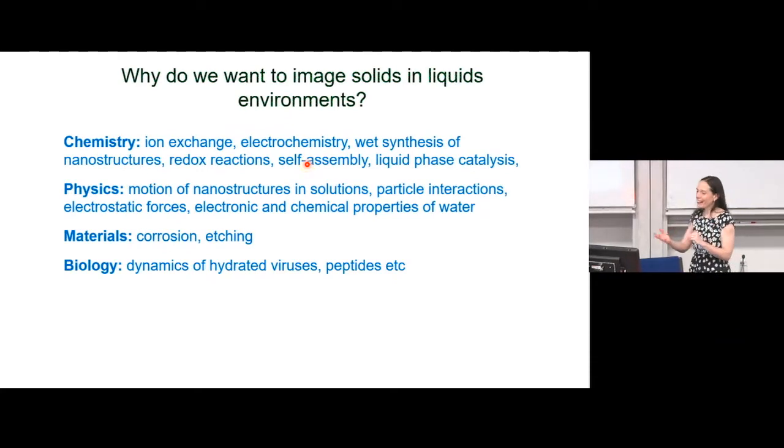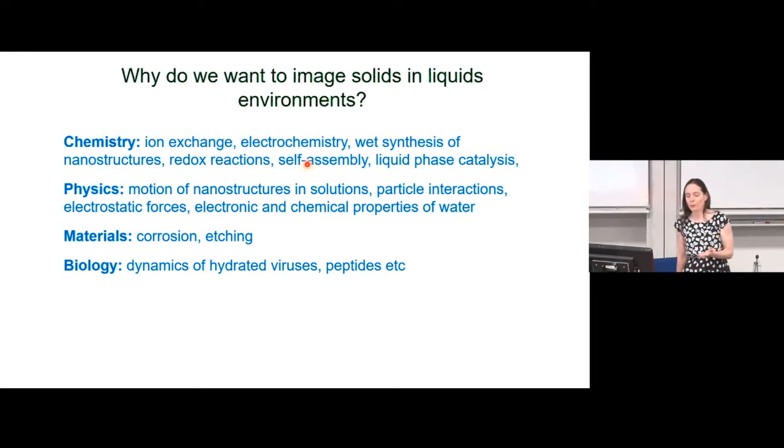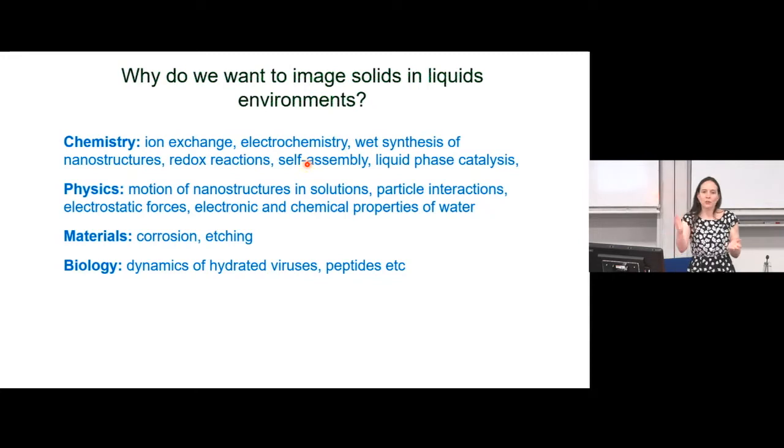So I am not studying horses or plums. There are loads of different possible chemical reactions that you might want to study that happen in a liquid environment, and these are just some of them. I've mentioned some work that we've done on ion exchange, which we've been really interested in. There's lots of work on electrochemistry, which we think is fascinating. Wet synthesis of nanostructures: an awful lot of the nanomaterials that we use are synthesized in liquids. There's physics. There are an awful lot of physics colleagues that I'm working with who are interested in understanding just the fundamentals of what happens to water at an interface. That is surprisingly poorly understood even at this stage, with all the clever techniques that we've got available to us.